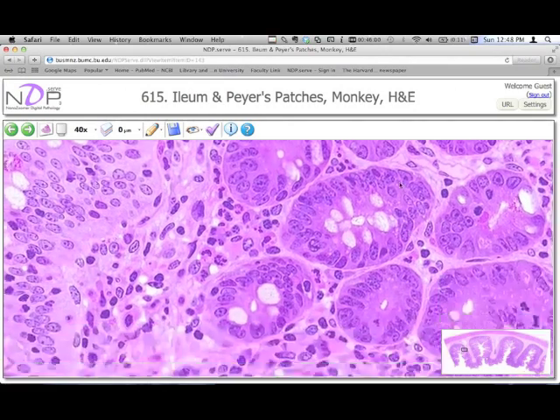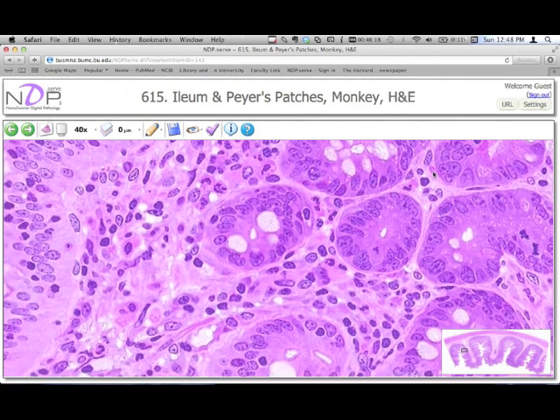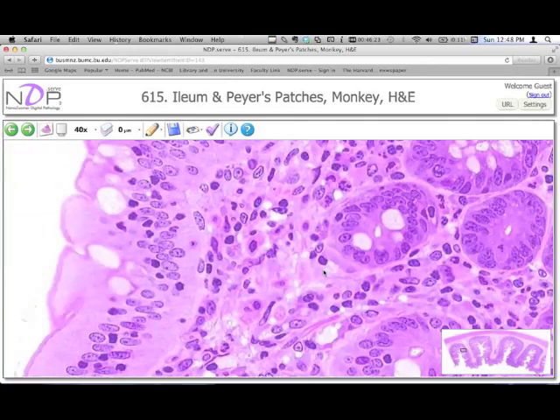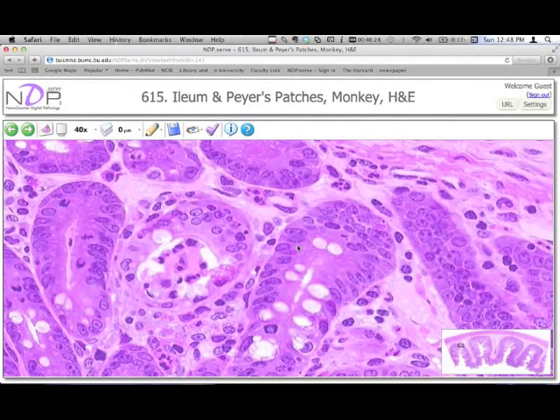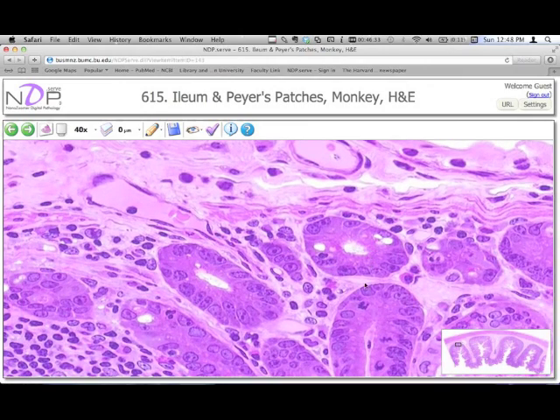And when we do, we find a couple of other things. We find something along these lines. See this guy right here? This is definitely eosinophilic. Same granule quality as we see in the epithelial invaginations, but we don't see a nucleus here. So this is going to be something that we'll consider in a second. The other thing that I want to consider is, let me see if I can find an example up here, is kind of a tricky example as well. And let's see, I thought I saw one a little earlier.